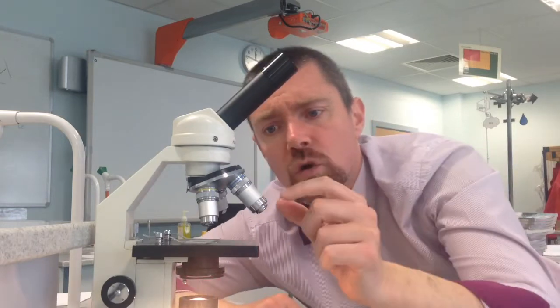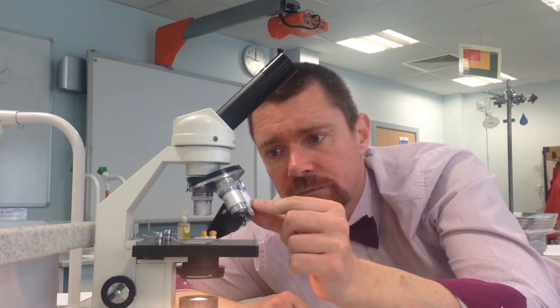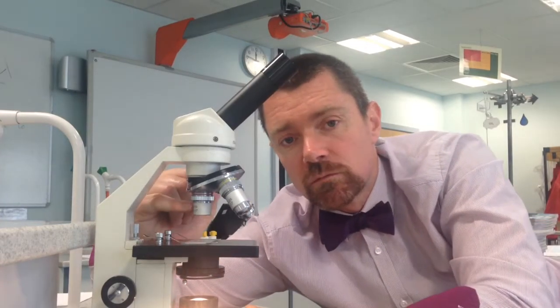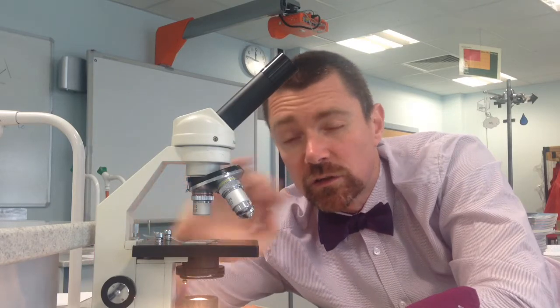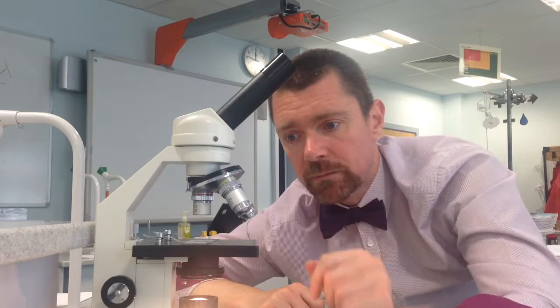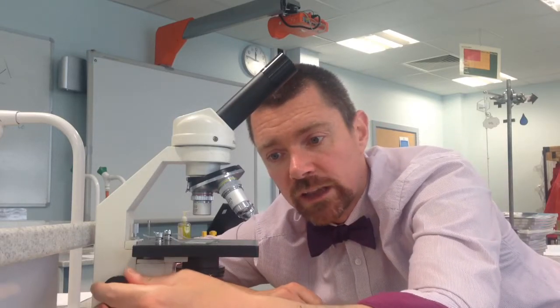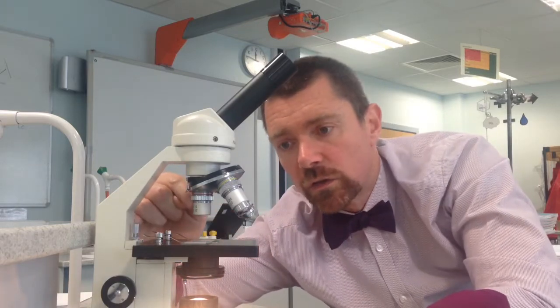Top tip number two: we turn the revolving nosepiece until we've got the smallest lens over the sample. The smallest lens is about four times magnification. So, two top tips — top tip number one: use the focusing wheel to get the stage as low down as possible. Top tip number two: start with the smallest objective lens.